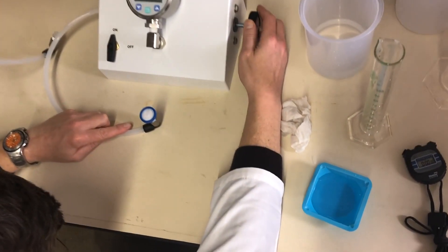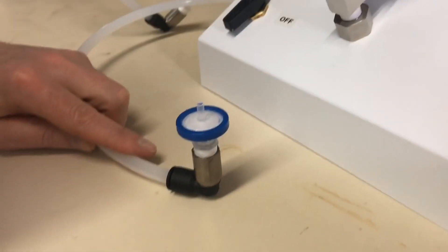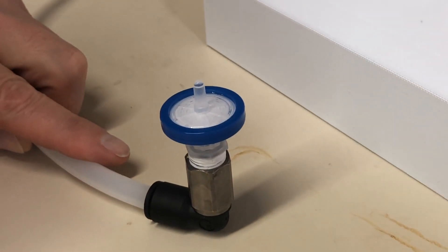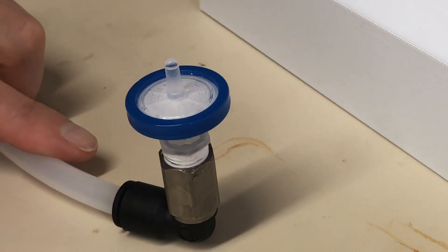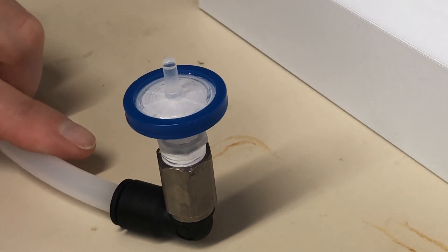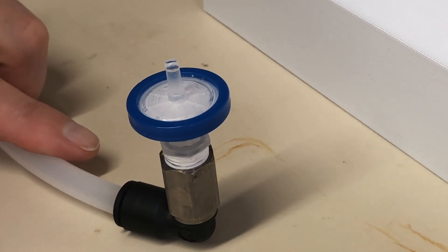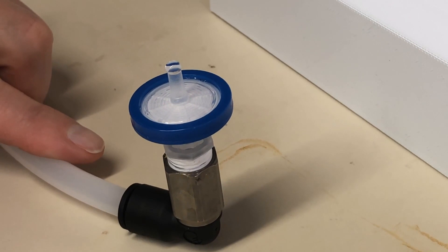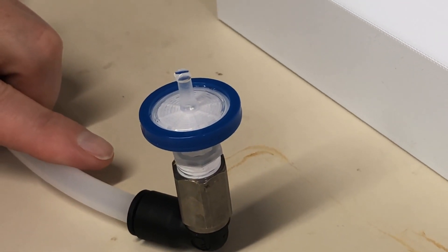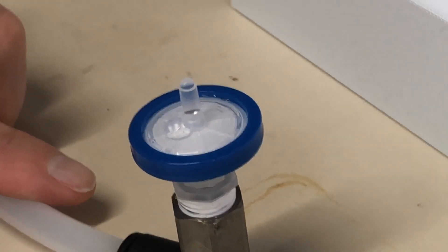Observe that the water will accumulate on the outlet — that's expected and it's not the bubble point. It's a bit higher than I would have guessed. Did you see the bubble? So that would be the bubble point of the filter. It's about 48.5 psi, checking on the gauge.